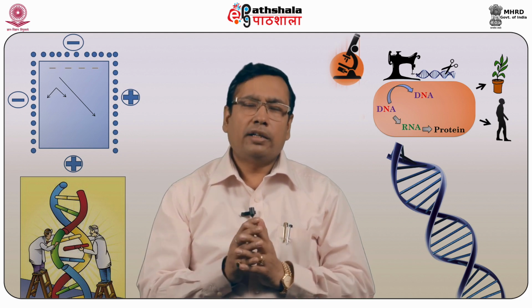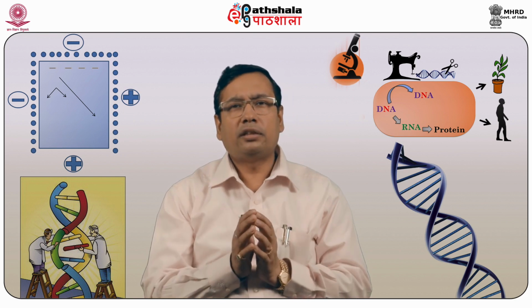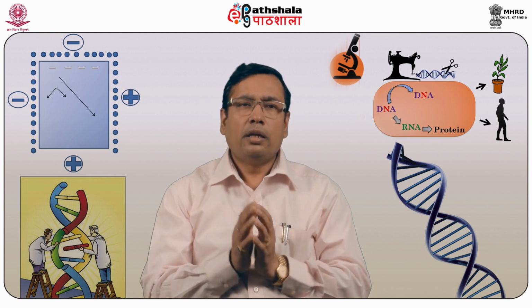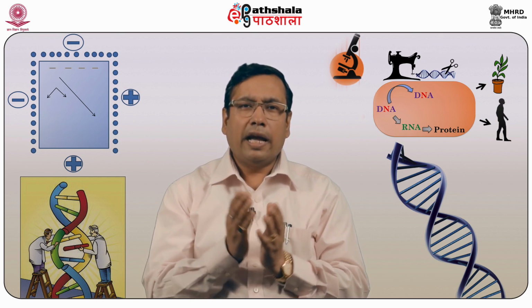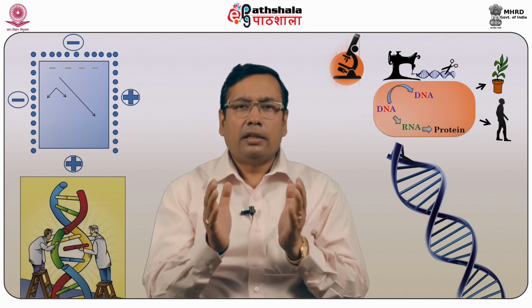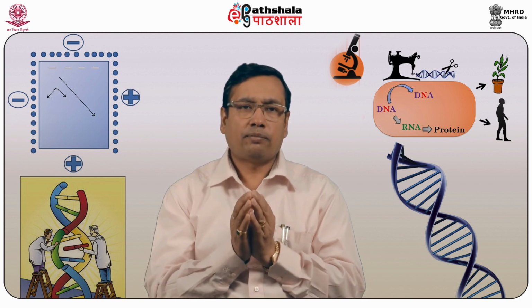The polymerase chain reaction is a very important and powerful technique in molecular biology where you can amplify even the tiniest concentration of DNA into an appropriate amount. Here, the DNA amplification is exponential, and after a certain number of cycles, you can have the appropriate concentration of DNA.